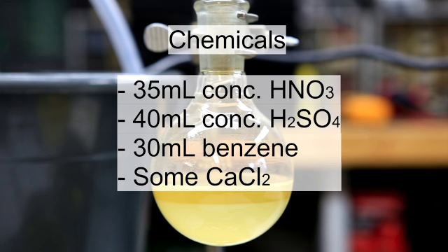The procedure that I used was the synthesis of nitrobenzene taken from Arrowwood. For the synthesis, I used 35 milliliters of concentrated nitric acid, 40 milliliters of concentrated sulfuric acid, and 30 milliliters of benzene. I also needed a little bit of calcium chloride as a drying agent.